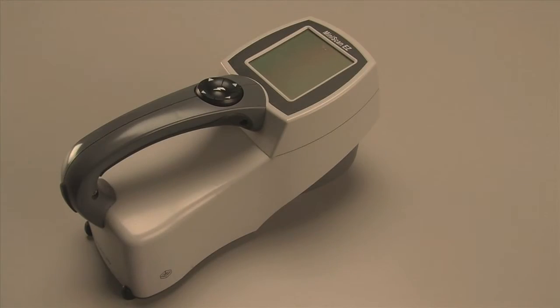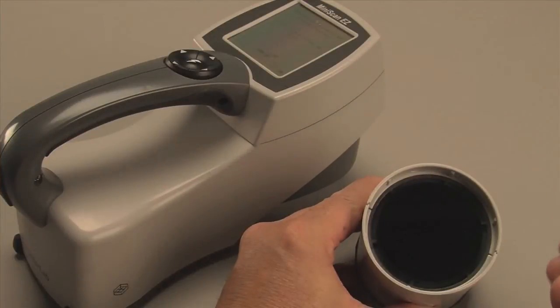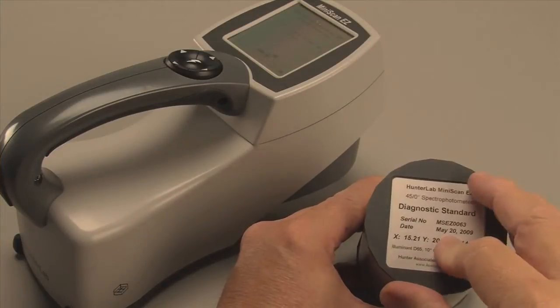To standardize your Miniscan EZ, first locate its standards cylinder and check to see that the tiles are clean and free from scratches.